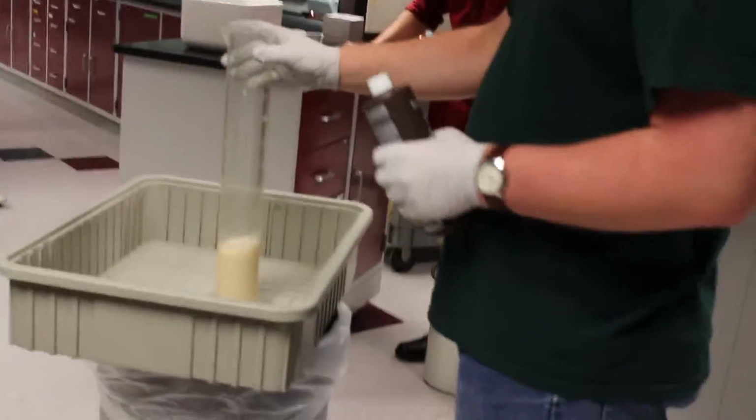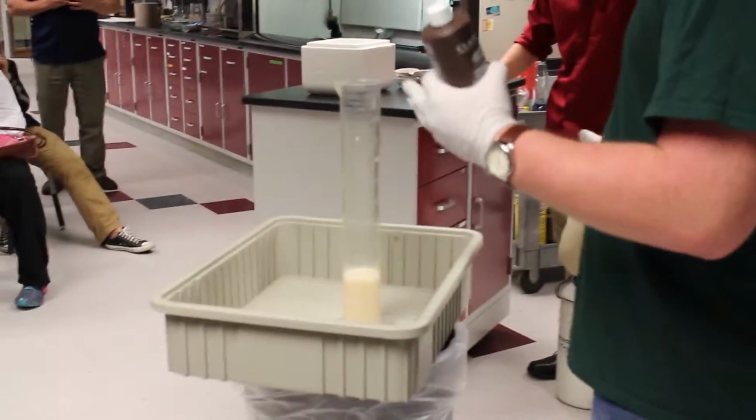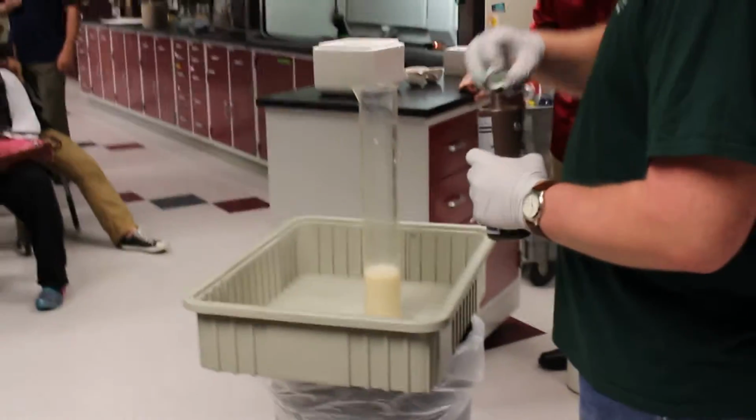We don't want to generate too much pressure because I'm the one who cleans up all these demos, and it just gets tiring after a while to clean up a bunch of suds from the ceiling. But anyway, this is also commonly done in Erlenmeyer flasks or volumetric flasks. And to that hydrogen peroxide, what's added is a yeast, like you'd get at the store for bread making. It works the same. Also, sodium or potassium iodide are commonly used. They cost a bit more than yeast, and they generate a more vigorous reaction than our yeast does. However, again, it's me cleaning it up, so I don't want to have to scrub suds off the ceiling.